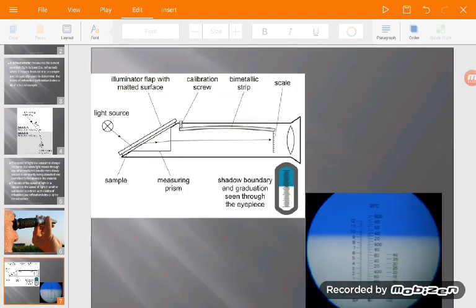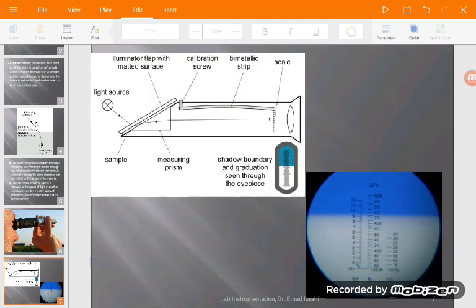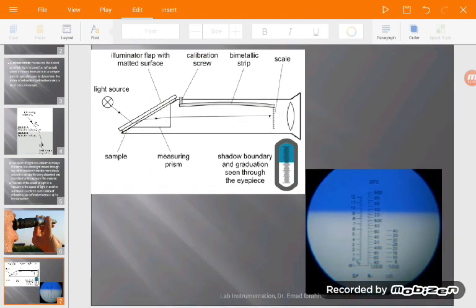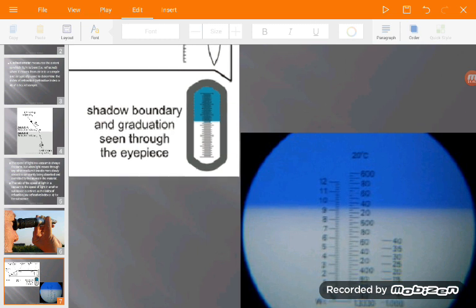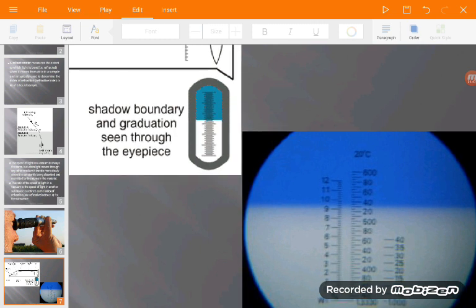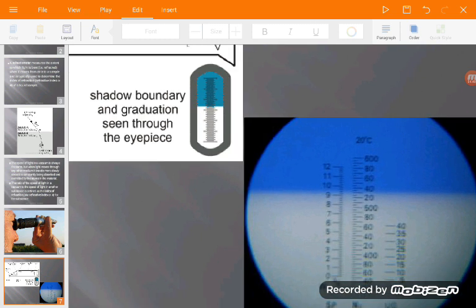Here, this is the scale below. As you can see, there is a shadow — the difference between the light and the shadow. This is the area you should read from.